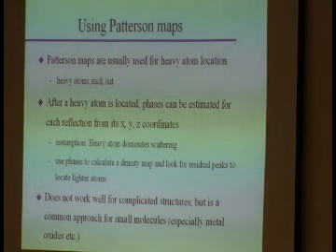Once you have those, you calculate a density map. Now you look for other peaks. And now you're not dealing with interatomic distances, right? Now we are directly dealing with our electron density, so we can directly get our xyz coordinates off that map. So that's why once we have any kind of starting phases, we usually go for an electron density map, okay? Because that makes our life much easier. And we like life to be easy, don't we?